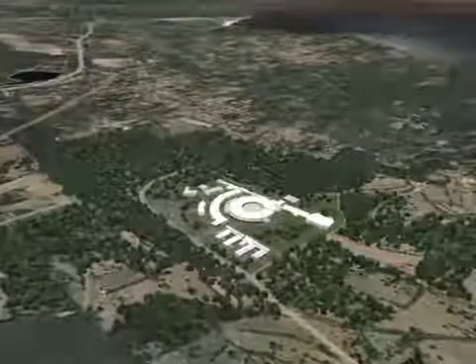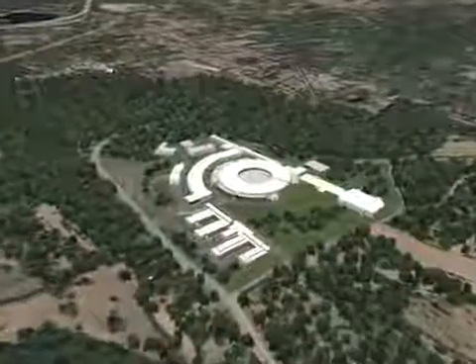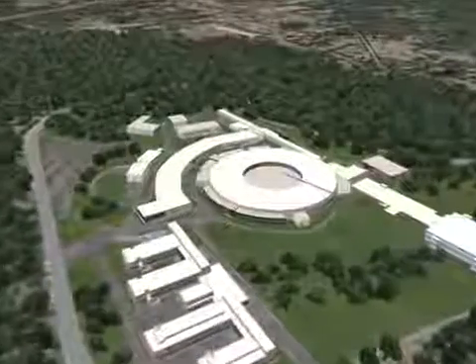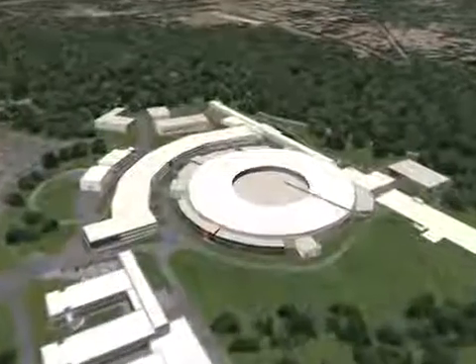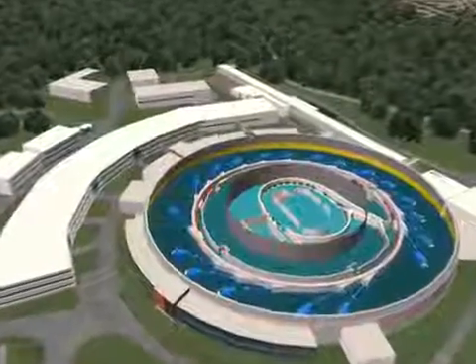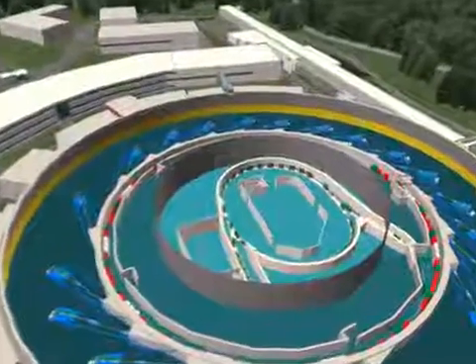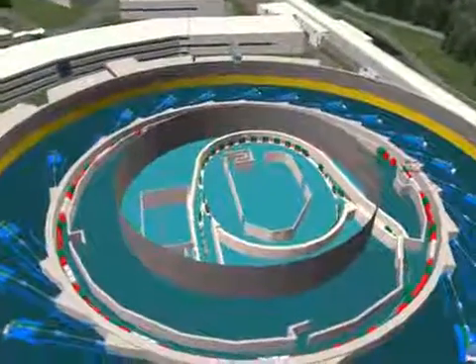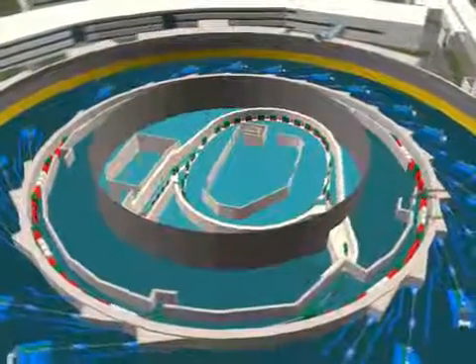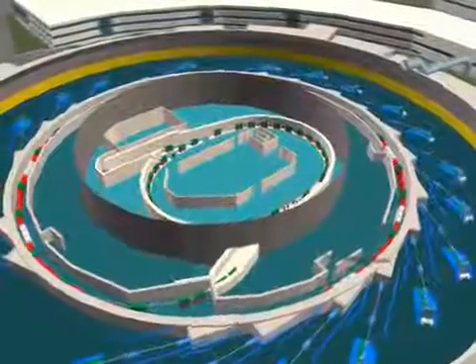The Elettra laboratory is located not very far from Trieste, on the Carso near the town of Basovizza. It was built to produce an exceptionally bright light, synchrotron radiation, a tool that enables researchers to detect structural details of materials otherwise invisible. This tool has many applications in different fields. Let's have a look at the source of this light with such exceptional features.